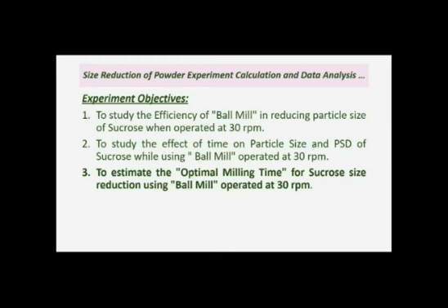First, you have to calculate the net weight. The net weight, also known as the frequency or retained weight, is equal to gross weight minus tare weight. Now, build up the following table, which shows the particle size intervals based on the sieve pore sizes you used.